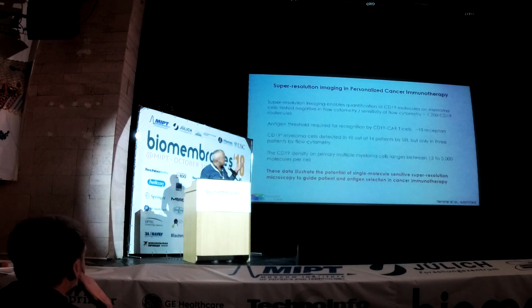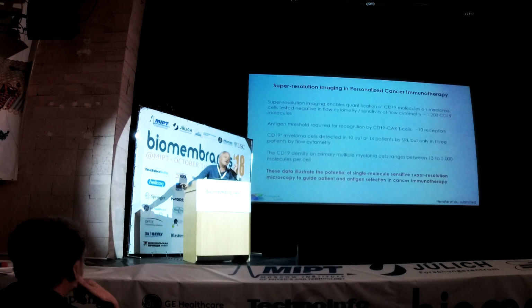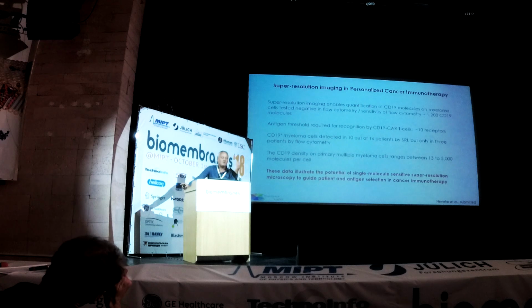So this is the summary at this point, so that I'm convinced that super-resolution microscopy and single molecule techniques help. In some cases, for really low expressing receptors, for low expression rates, you don't even need super-resolution microscopy. You simply have to do single molecule sensitive wide field imaging. Only for these higher expression rates, single molecule super-resolution microscopy helps.